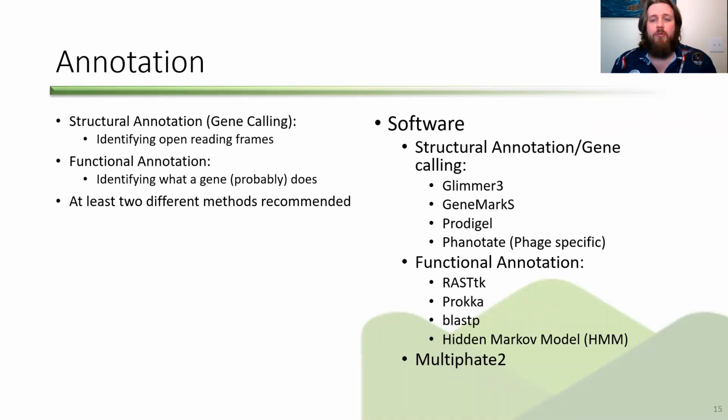Now with functional annotation, I really, really like RAST. And, I guess I should put this at the beginning of the video, but none of these companies or software makers are paying me. I'm just going through and talking about my experiences. So my opinions are my own. I probably should put that at the beginning of the video, but anyway, RAST-tk.